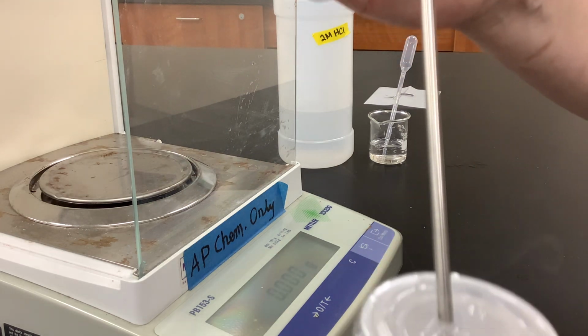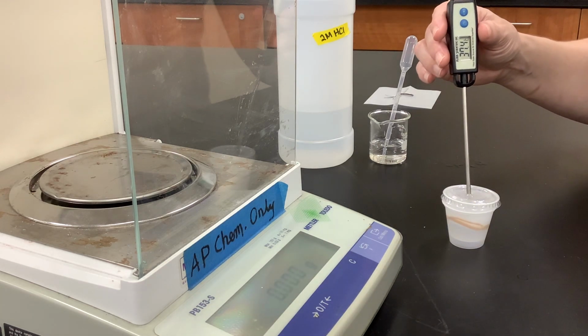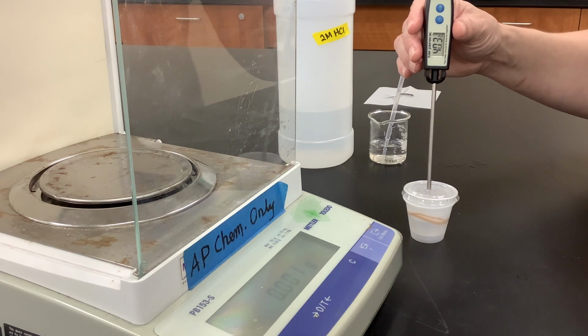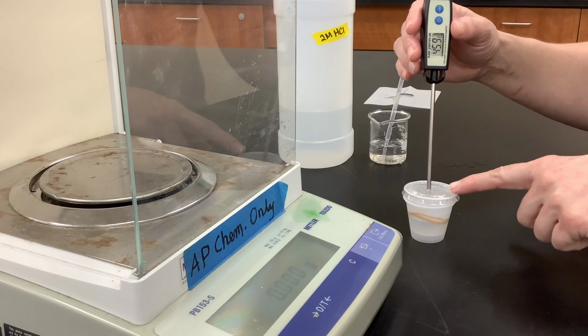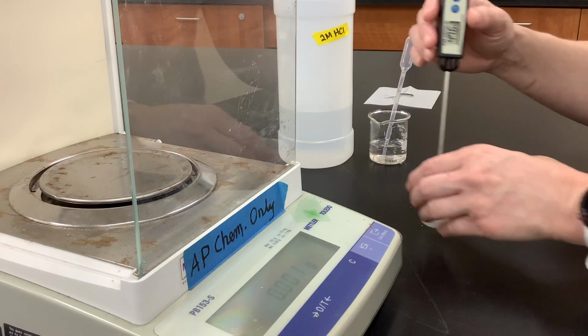You can notice the temperature changing. You may be able to see it in here. Basically, I'm going to hold this thermometer in here until I no longer see temperature changes. Remember, we notice the direction that the temperature is changing, and we want to keep measuring until that directional change stops. Also, we're looking at the reaction container. You can see some fizzing and bubbling, so we also want to monitor that.